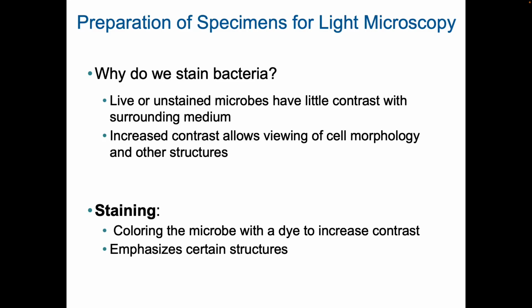So we left off in class on Thursday talking about the different types of microscopy. So really briefly, I'm going to talk about how to prepare specimens for microscopy and also different types of preparations that one could do in a microbiology lab. And again, I know this is going to be a review for what a lot of you are doing in the lab or have done if you've already taken the lab. But for those of you who maybe are not taking the lab, this will be important information that's relevant to the topic of the course.